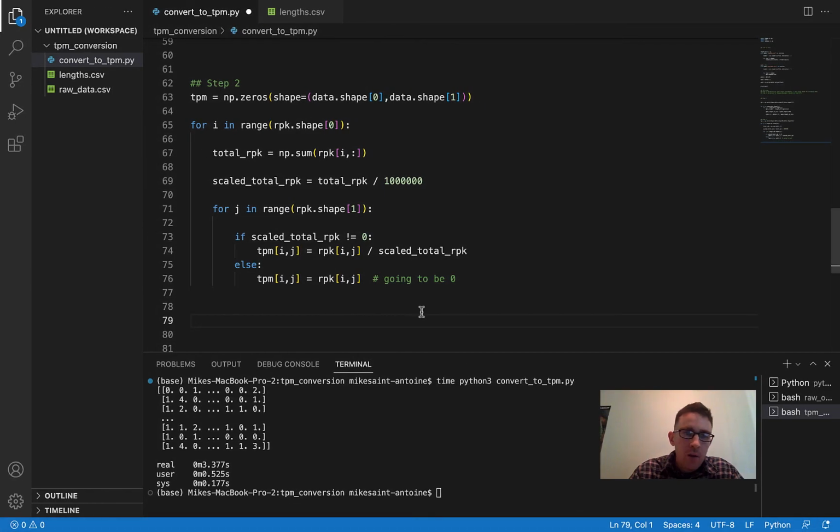measurements for each sample. For this, I'm actually going to use pandas, and I know in my videos I don't use pandas that much because, to be honest, I don't like pandas that much. I don't find it super helpful for a lot of things. But for saving a CSV, if you already know a nice format you want it in, I actually do find pandas helpful.